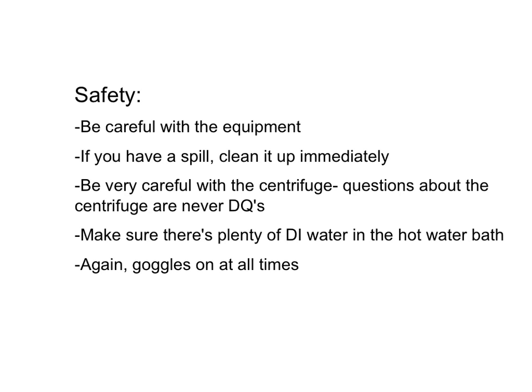You will be using centrifuges throughout this lab. No question about the centrifuge is a dumb question. They are very, very expensive. If you break them, that's a very, very big deal. Mr. Flato spent a good part of Wednesday and Tuesday fixing a bunch of the centrifuges so that we could have a bunch to use. So if you have any questions about the centrifuge, please ask. They need to be balanced. Also, you've used centrifuges a little bit, but please, please, please ask. Don't just jump right into it if you don't remember how to use it.